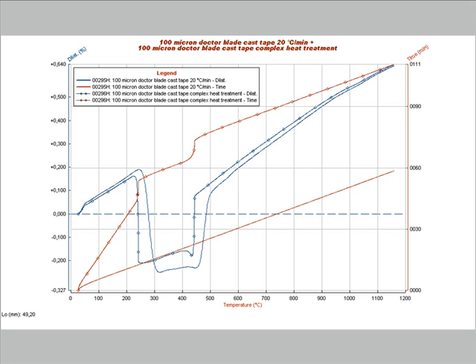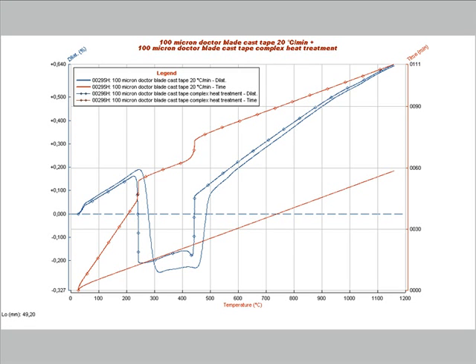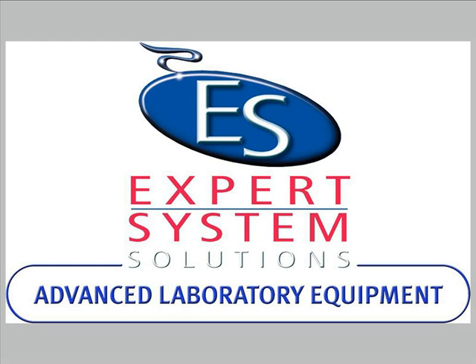Furthermore, thanks to the total absence of mechanical pressure on the sample, it is possible to carry out the test even on materials which cannot withstand any pressure, even minimal. Thank you for following with attention this presentation of the features of the optical dilatometer MISURA LT.